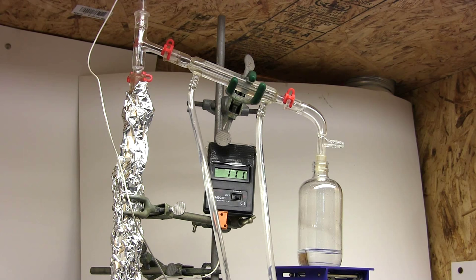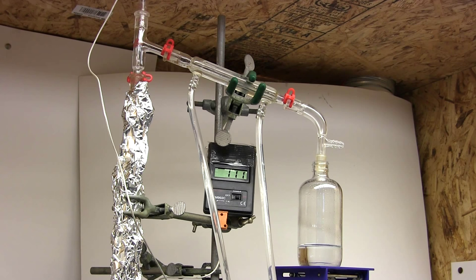A very powerful professional column is something called a spinning band distillation column, which uses an actively spinning central element to slam down the condensation into the source flask. Only the volatile vapor can pass. The spinning element makes it extremely difficult to flood or overload so it can use a vacuum insulated column without problems. Such a column is very expensive so I'll probably never get one.